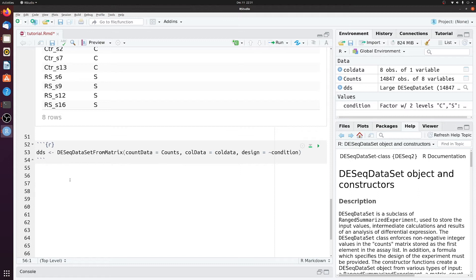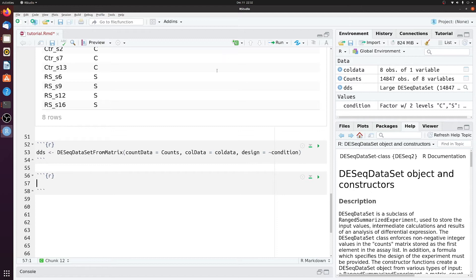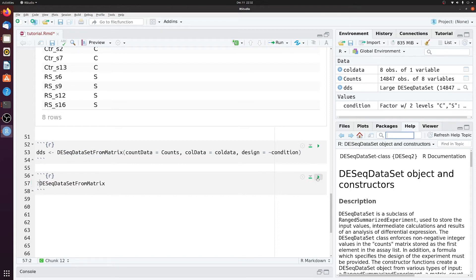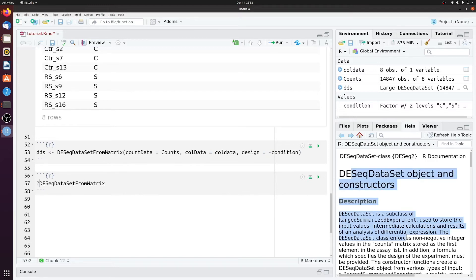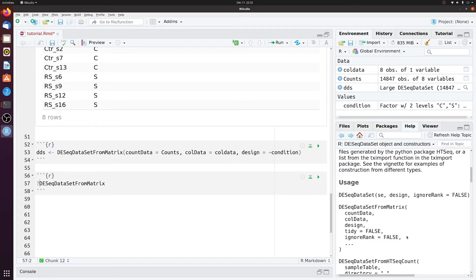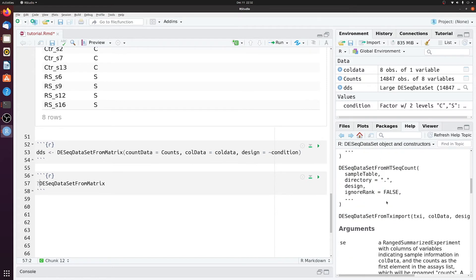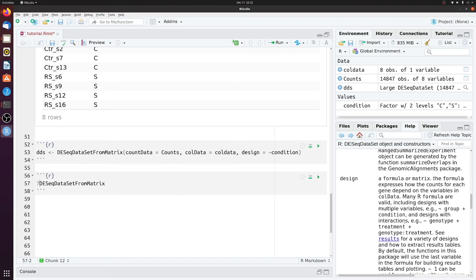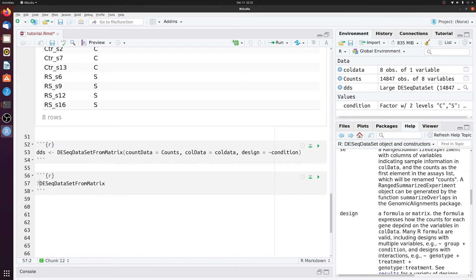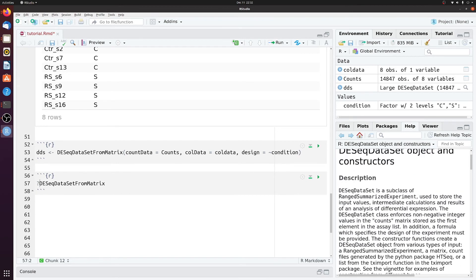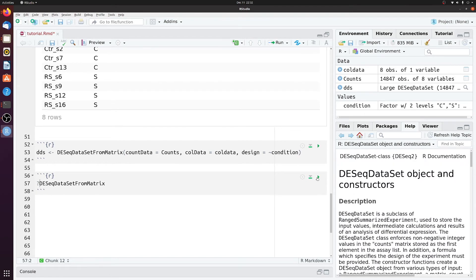And one really useful tip for doing anything in R is if you don't understand how something works, you don't understand what it does, you don't understand what all the different arguments of a function are, you can put a little question mark in front of it. And then when you run it, it'll actually pop up over here on the right. And it'll show you, it'll give you a little manual of it. So if you're ever stuck and don't quite understand something, I recommend doing that first.